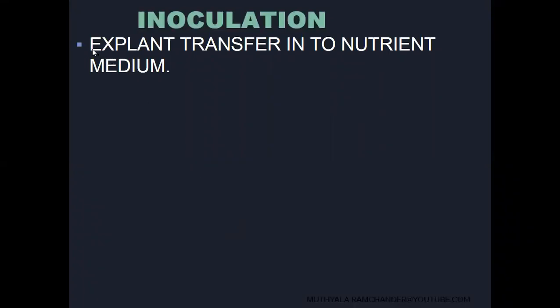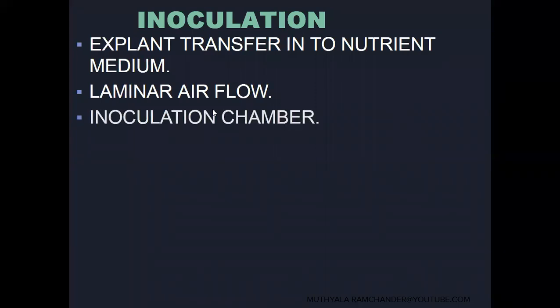Now the next step is inoculation. Inoculation means sterilized explants are transferred into sterilized nutrient medium in aseptic conditions. For inoculation, we use laminar airflow, which maintains in vitro or aseptic conditions.